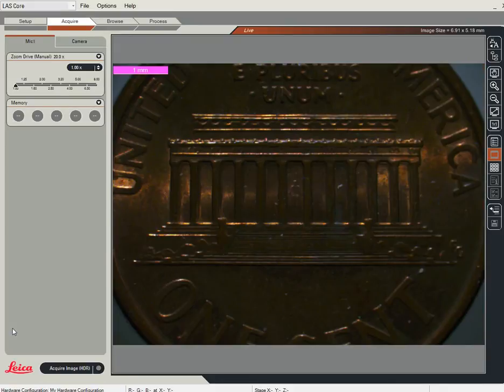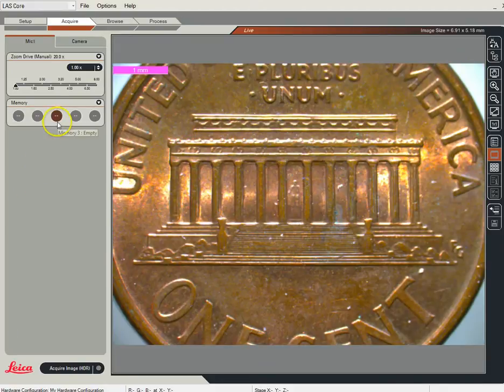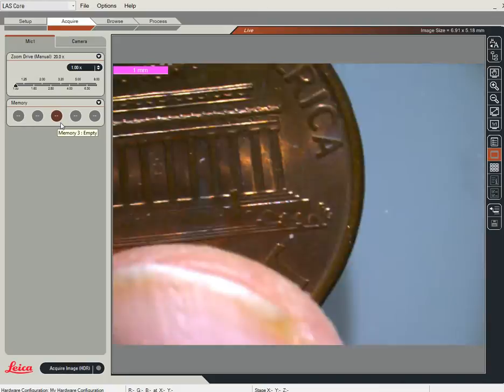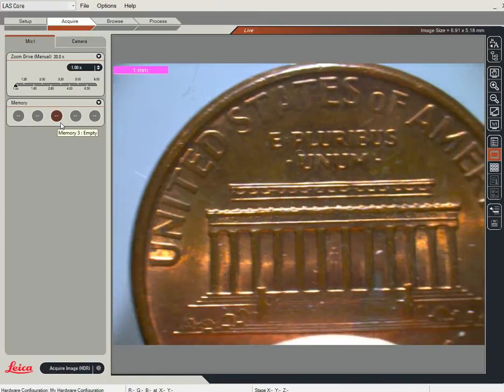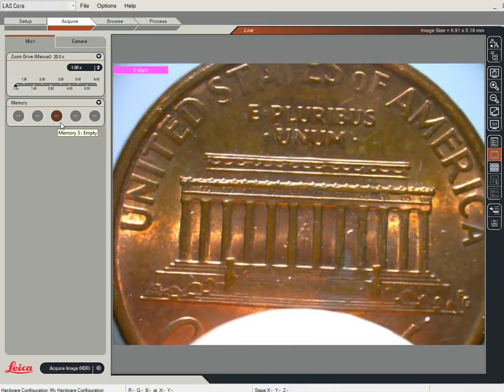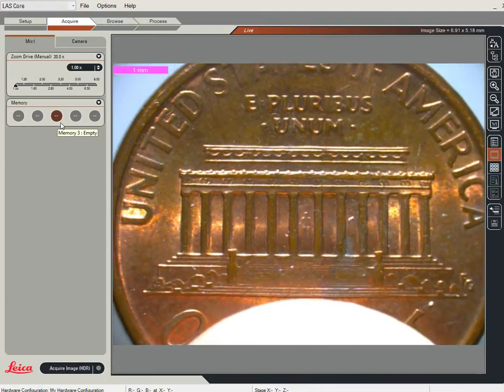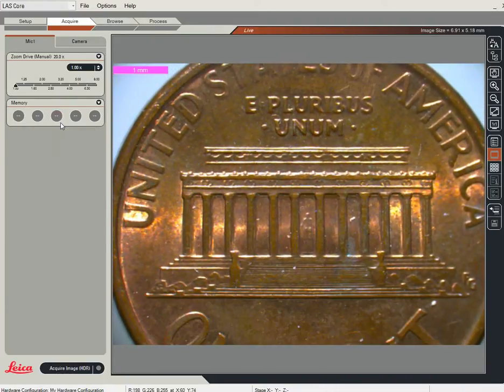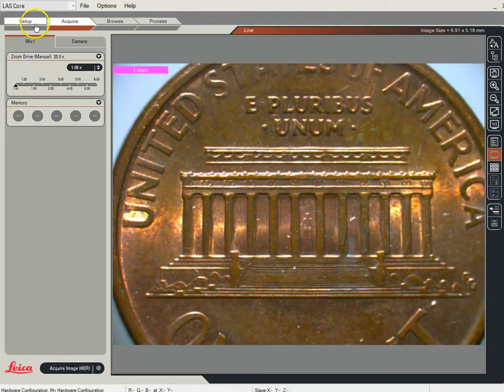The first thing you'll notice is that we actually do have a live image here. You can see there's my finger and we can move this little penny around. There are lots of controls on this — we don't use all of them, so don't panic on that.